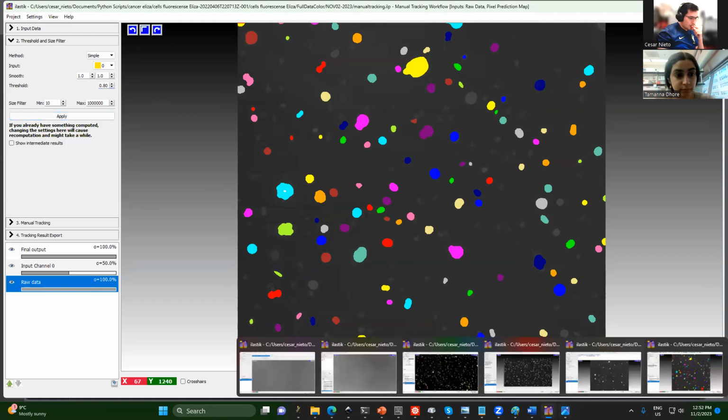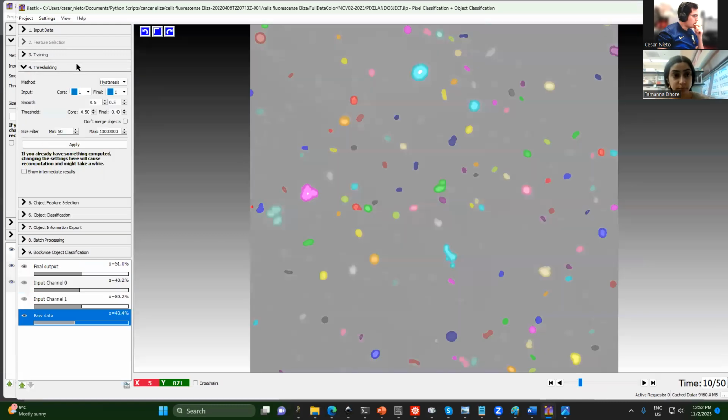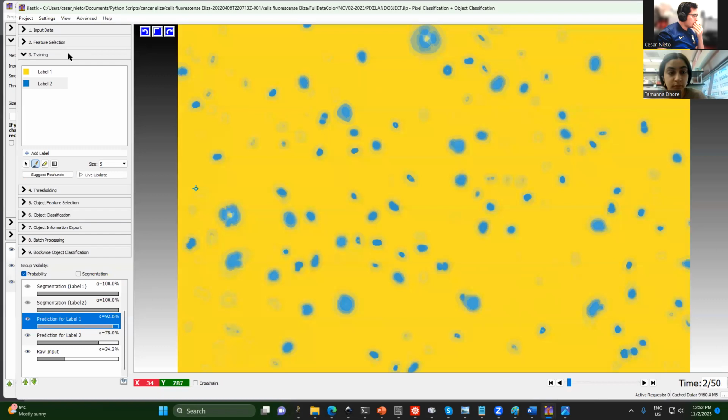Okay, here in the thresholding, you can maybe make it smaller by increasing the threshold.